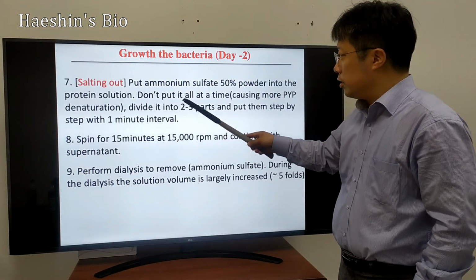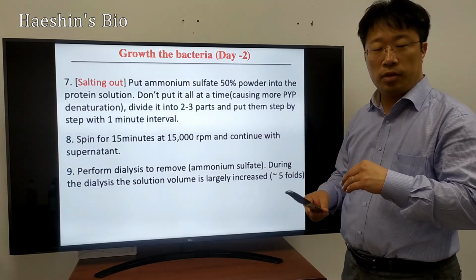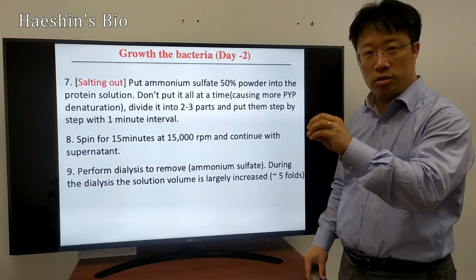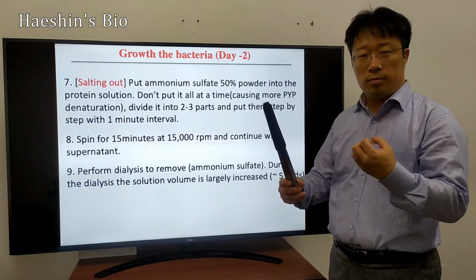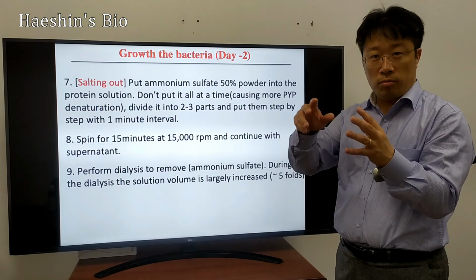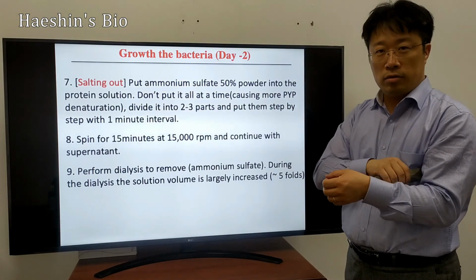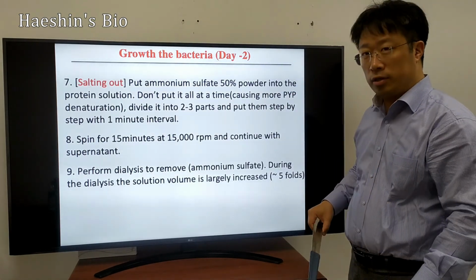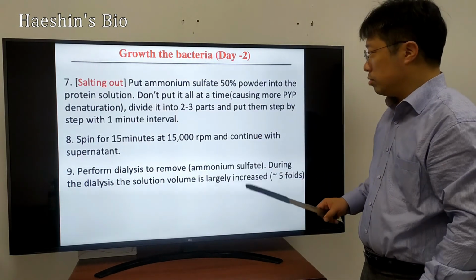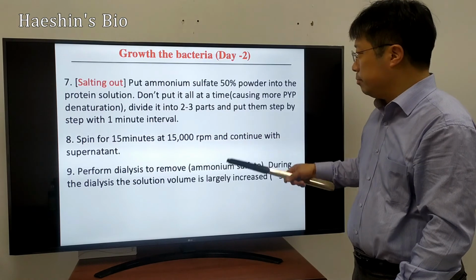So the important thing is don't put all of this ammonium sulfate in at a time. This whole step has to be a thermodynamic step. So that means we have step-by-step additions of the salt. That will take time for the added salt in solution, and the salt will take water molecules out of the system. That will take a time, and then you put in an additional amount of this ammonium sulfate. And then they will take water molecules from the protein to the added salt. So repeating this process, don't put it all at a time.